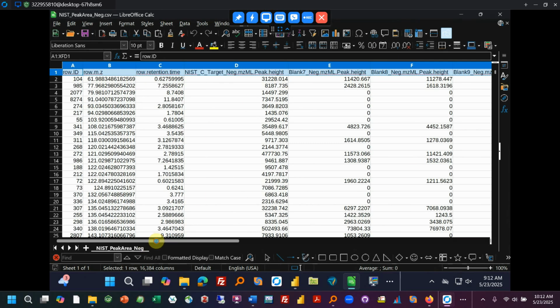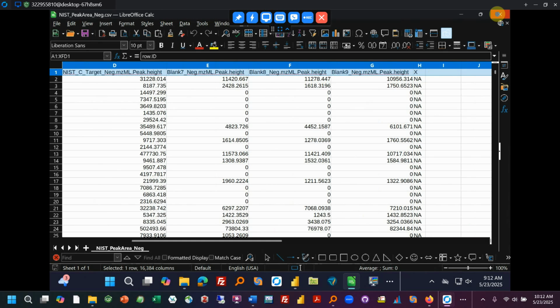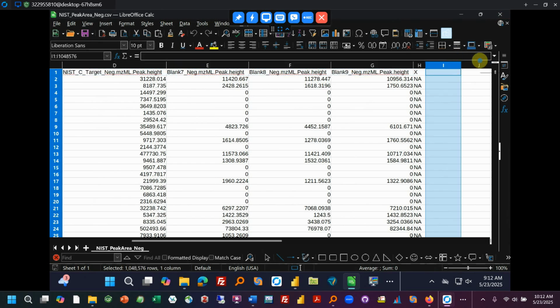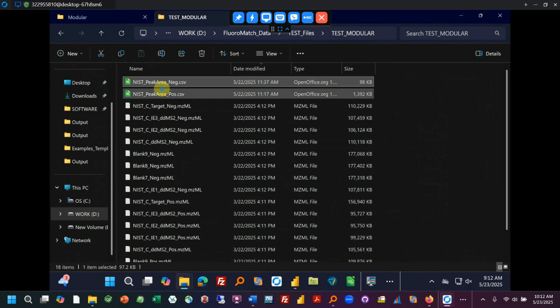Other good things you probably want in your sheet, not that they're necessary, is your peak areas, peak intensities. Those can all be helpful things, obviously, to have along. And you could have annotations in any of these columns. Again, the sheet can have as much information as you want, as long as it has retention time, mass to charge, and a row ID. So you may only have negative polarity mode, you may have only positive, or you may have both. In this example, we show both.